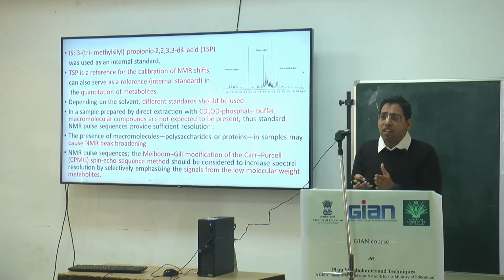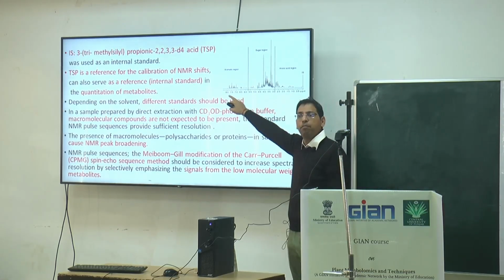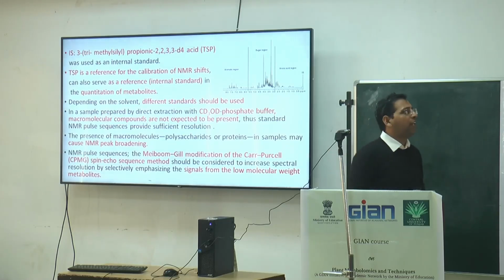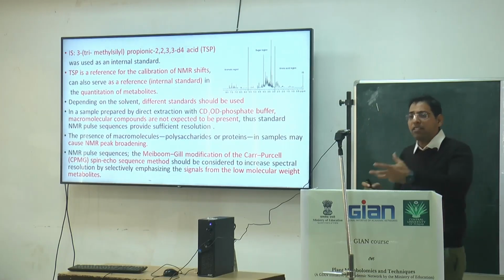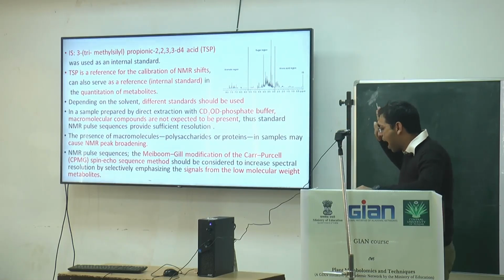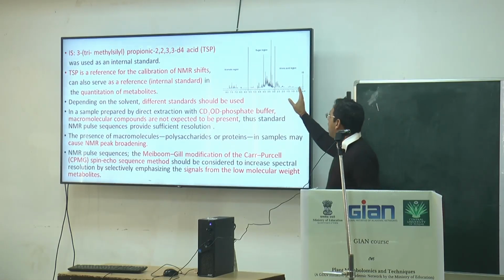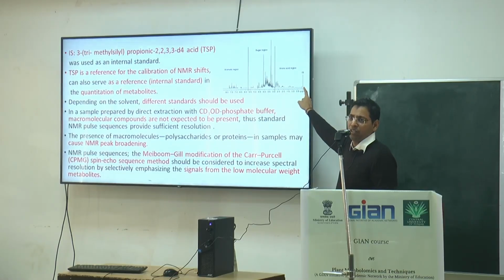Whatever sample you have, the peaks will be between 2 and 8 ppm. But I will also explain what the meaning of ppm, delta, and the chemical shift is. Sometimes we are using this internal standard. This is a sample with the NMR internal standard, so we have to identify the different peaks with respect to this internal standard only, and how much they differ from it.